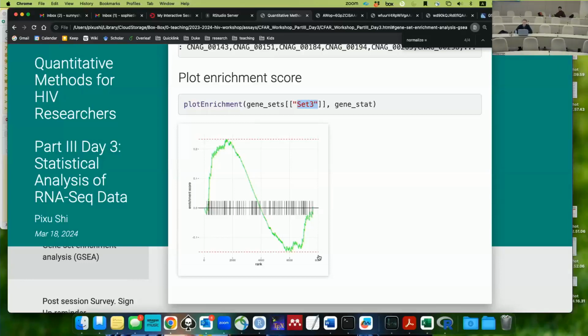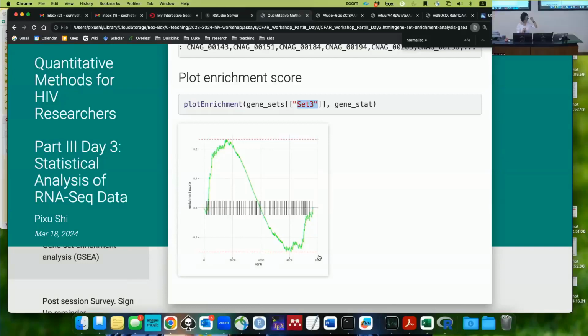Yeah. I believe if you have fewer samples than like 7 or so, they recommend you shuffle the genes, that permutation. Right? For this one, there's no way to shuffle the samples because you are not telling the software what phenotype labels each sample corresponds to.